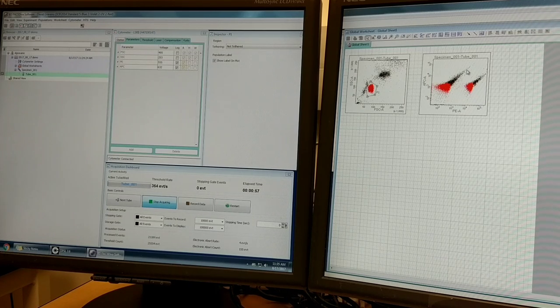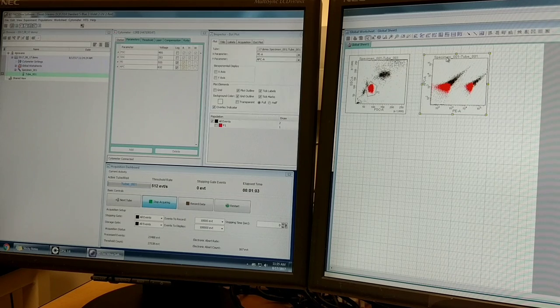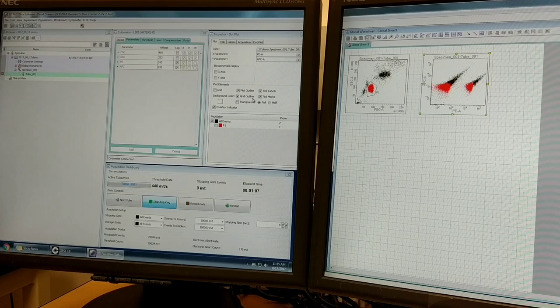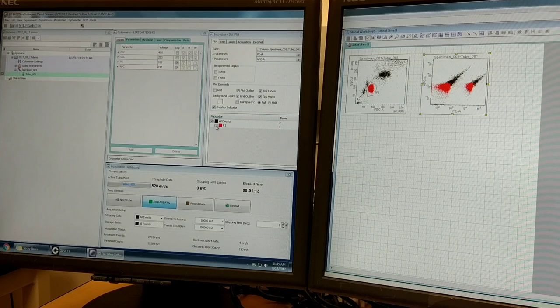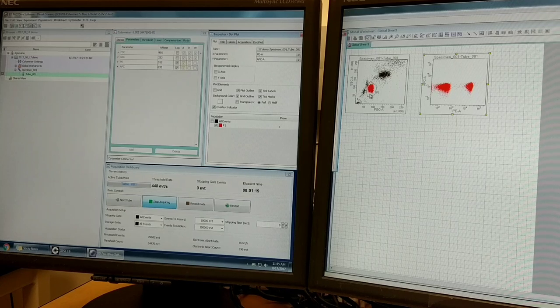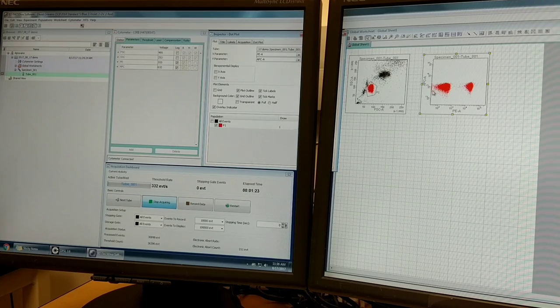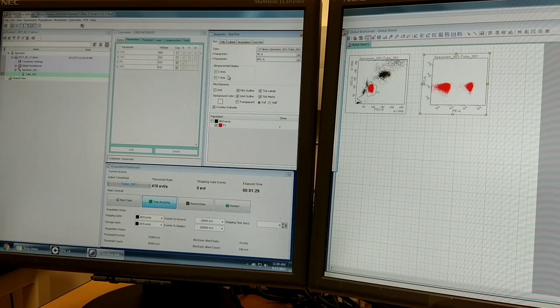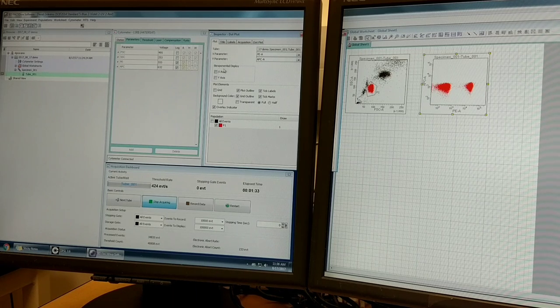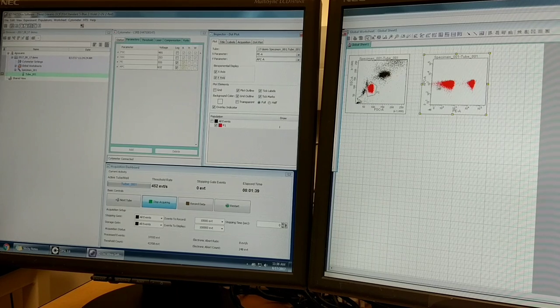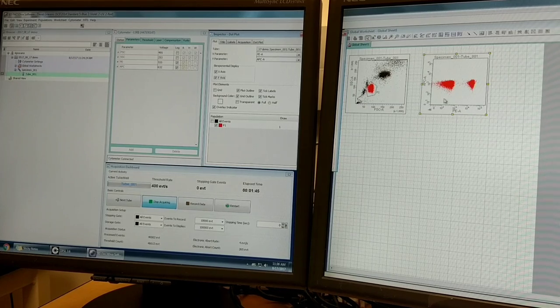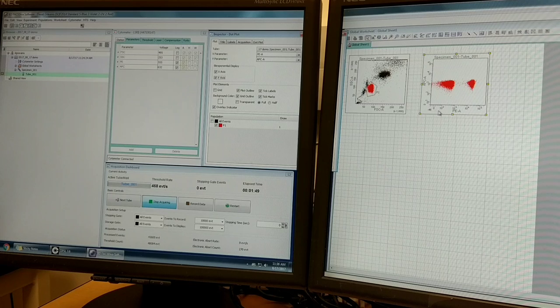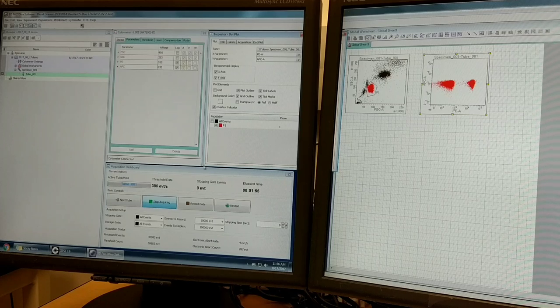To only visualize the stuff I'm interested in, I click on this plot. In the inspector, it's popped up some options specific to that plot. Now I can just click the P1 button and it's only going to display what's within the P1 gate. You can see there's some data squished on this axis. To get data off the axis, I almost always on fluorescent plots turn on what's called the bi-exponential display. If I click the X and Y axis, it's going to pull that data off the plot. Sometimes it takes a few seconds to readjust the scale. It's allowing you to see the negative territory of this plot so nothing will be on the axis, which is usually good.